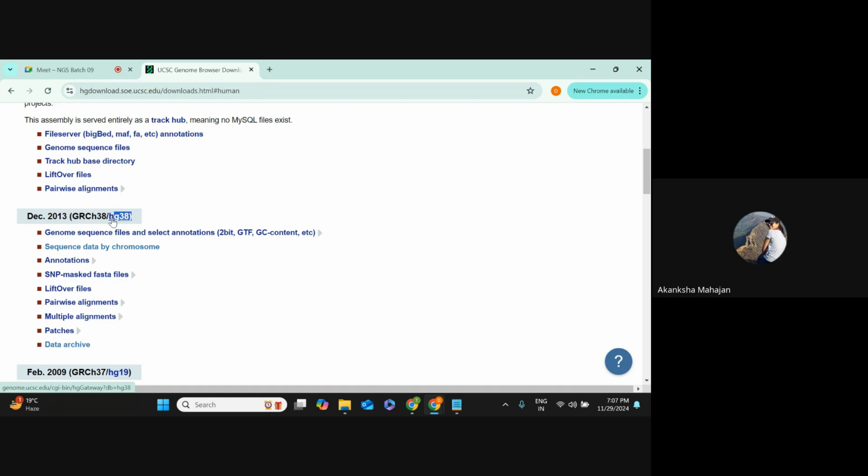Actually, this is just the reference ID for the human. That's it. But make sure the assembly ID is different for different organisms.